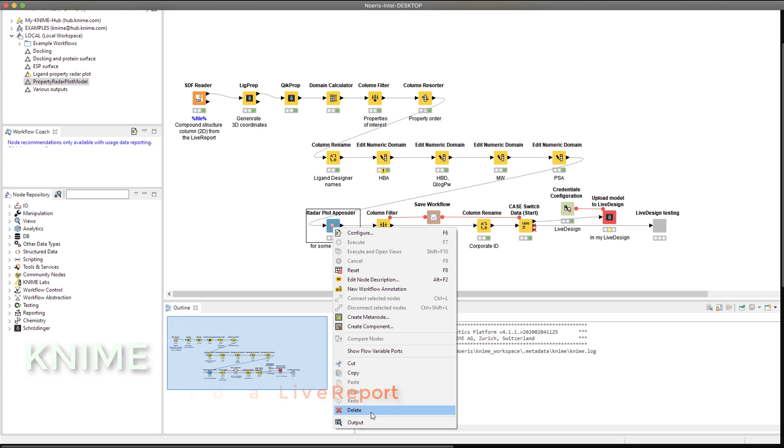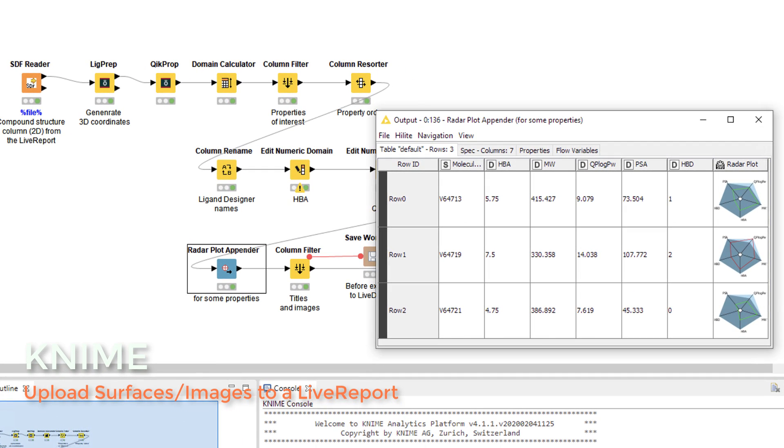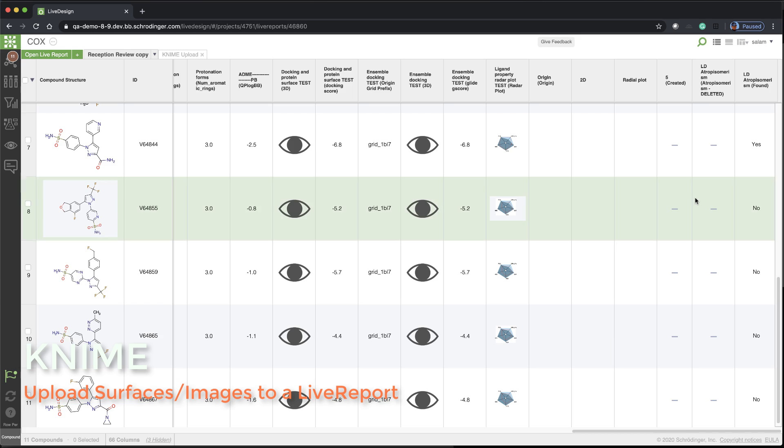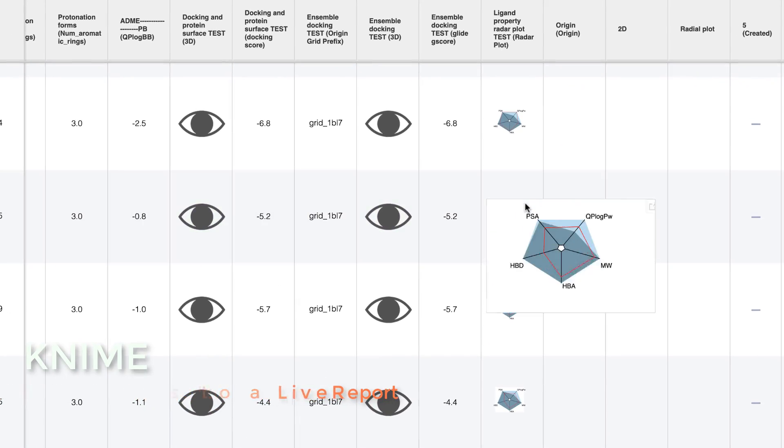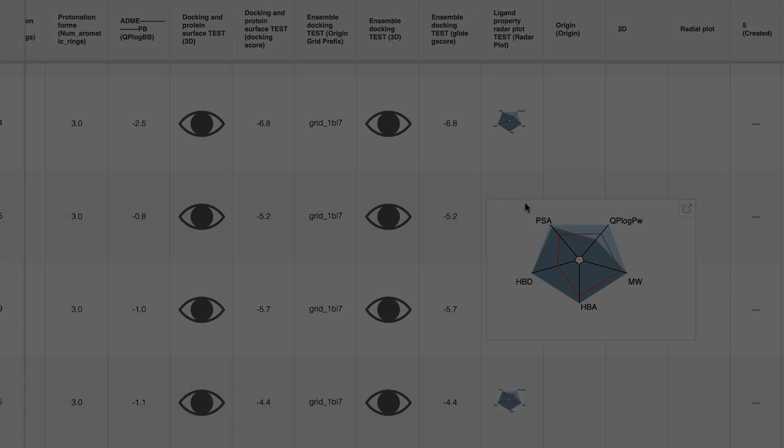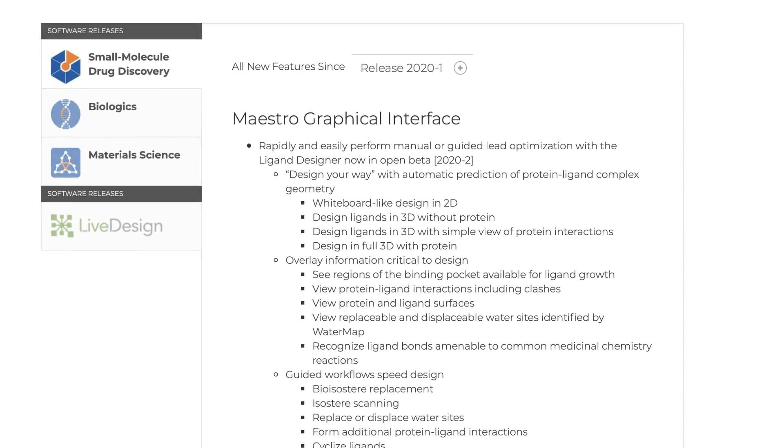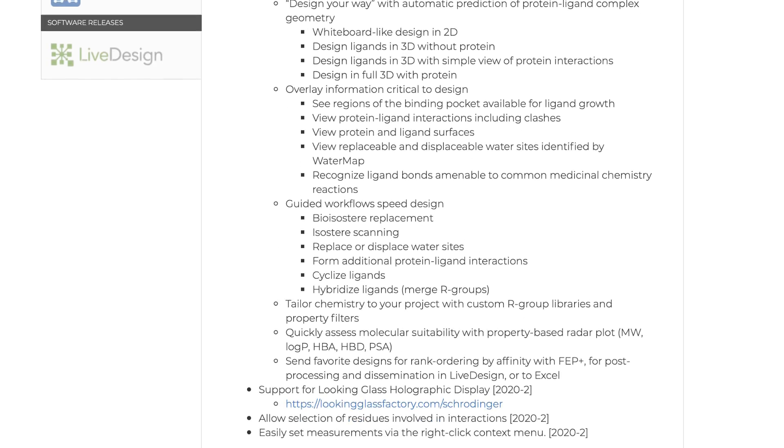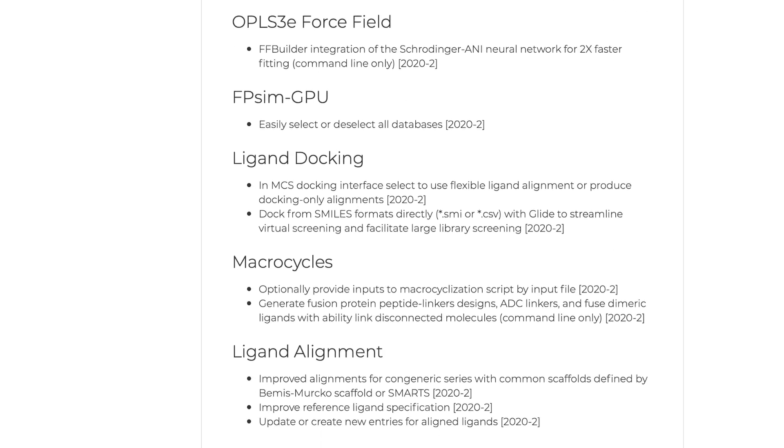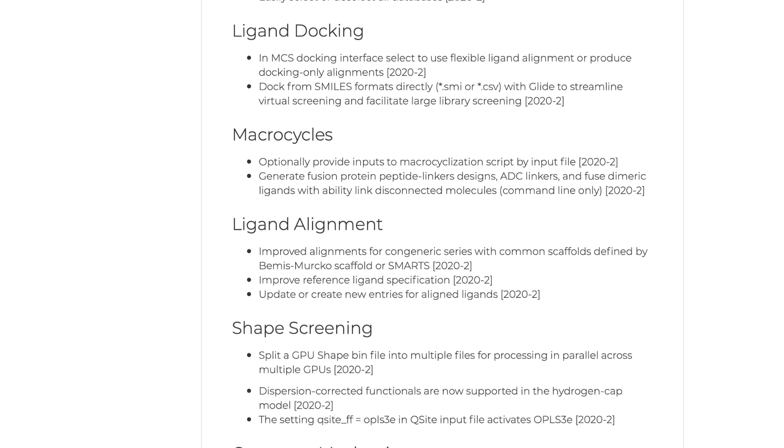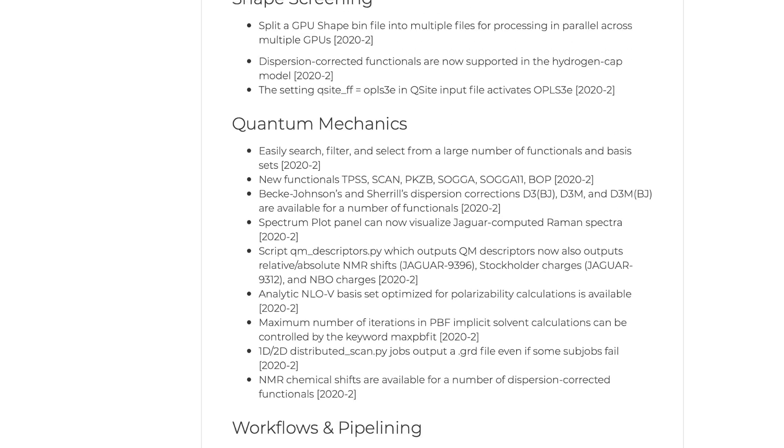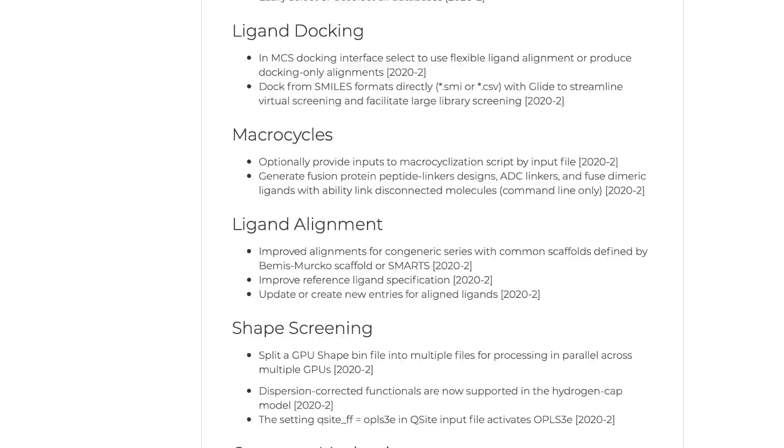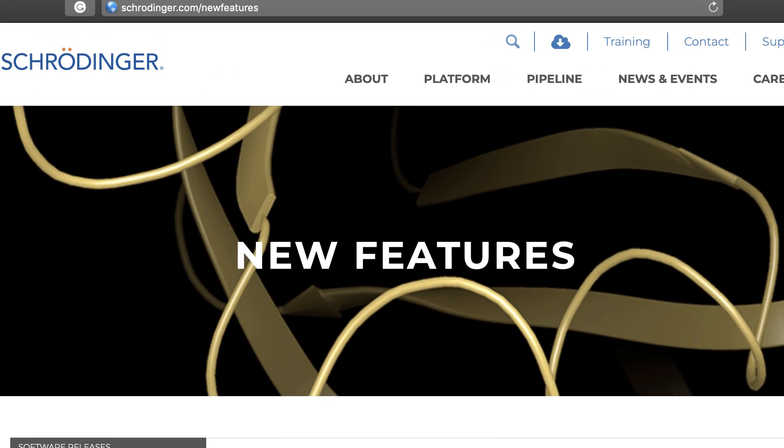Finally, over in KNIME, surfaces and images can be uploaded to a live report. These are just a few of the highlights of the 2020-2 Schrodinger release. As always, for the complete list of all previous enhancements and features, visit schrodinger.com/newfeatures.